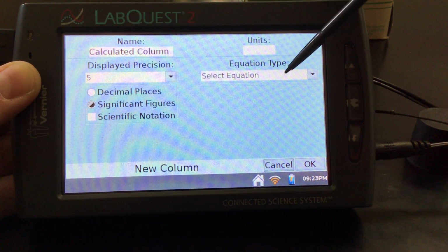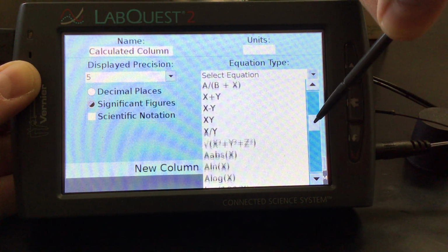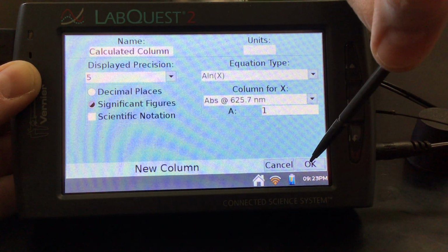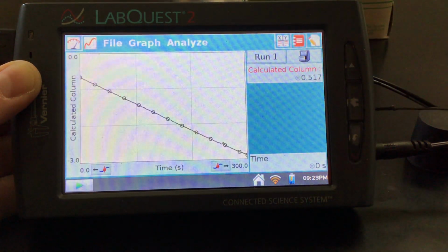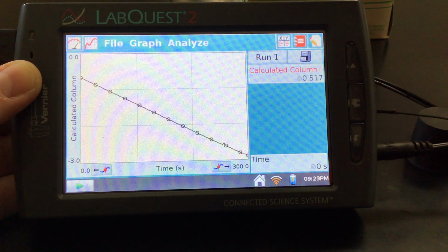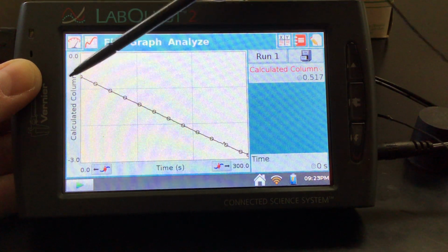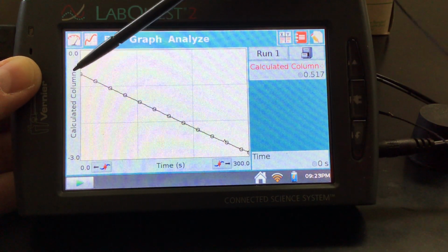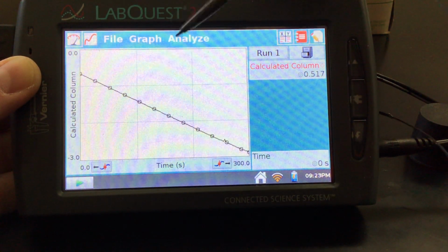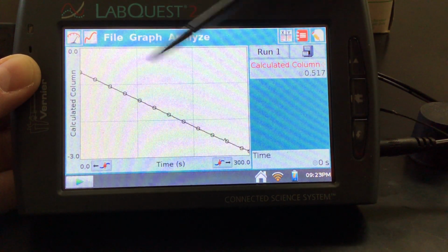And I'm going to select my equation type. First one I'm going to test is first order, by looking at the natural log versus time. And here's our analysis. Man, that looks really linear. So to me, right away, this is telling me that this is first order. Our calculated column, which you see on the y-axis is now changed, is very linear, and this is natural log versus time.